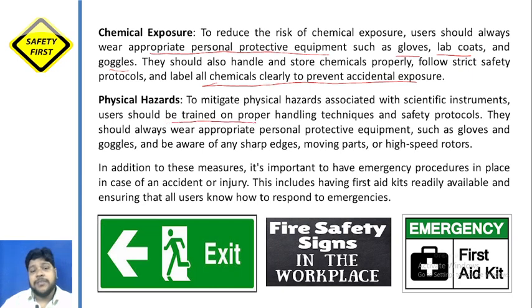The training plays a very important role when we are working in any lab where physical hazards are possible. So there should always be appropriate personal protective equipment such as gloves and goggles, and users should be aware of sharp edges, moving parts, and high-speed rotors.